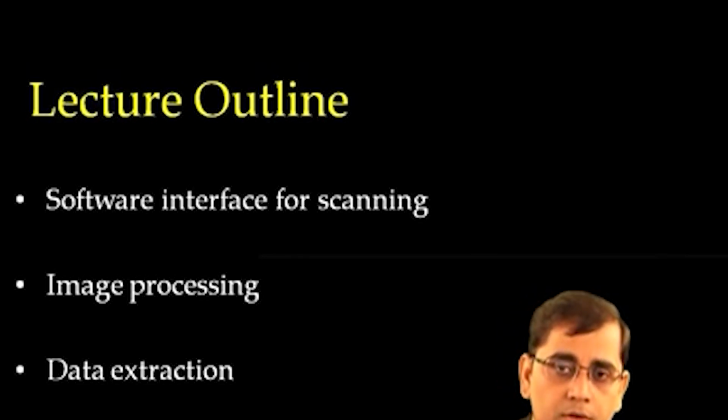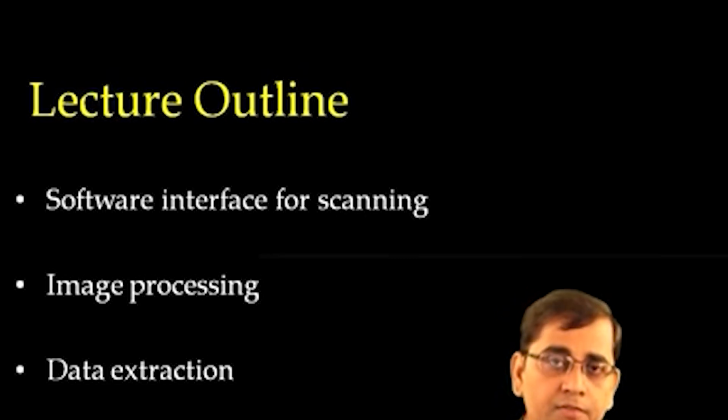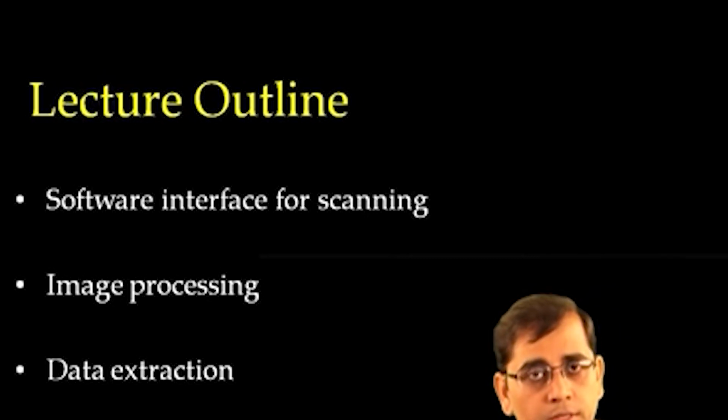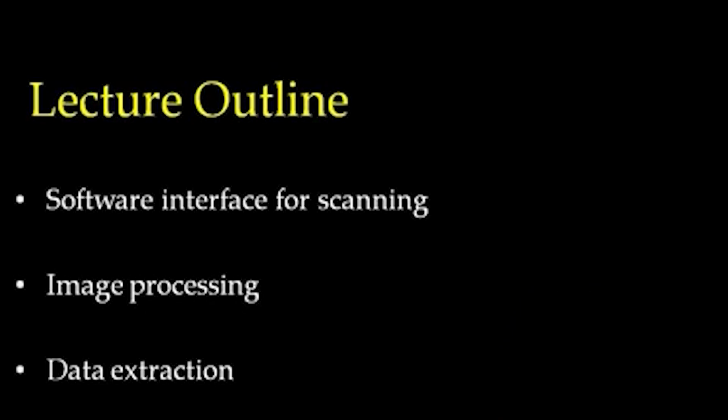But before we move on to the live demo session on scanning, we can briefly discuss the software in general and how the user interface looks like. So, welcome again to this lecture, Pankaj.